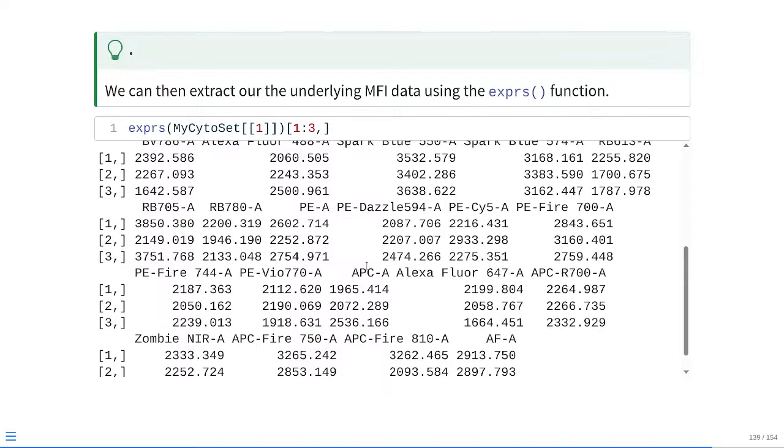So unlike commercial software, where often the transform is applied separately, on top, so just changing how we visualize the data, in the context of transformations that happen within R, it is actually going and transforming the values that are present within the column, which is why that inverse transform is very important, because it allows us to go back to what the original values were before we actually went in and transformed the values present.